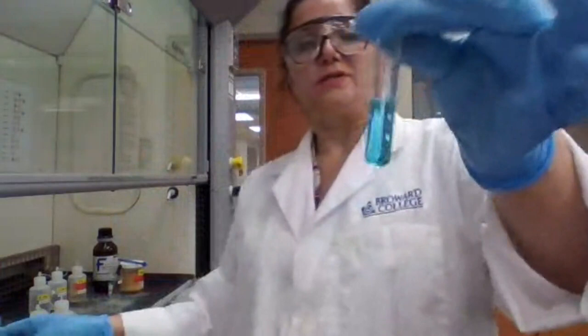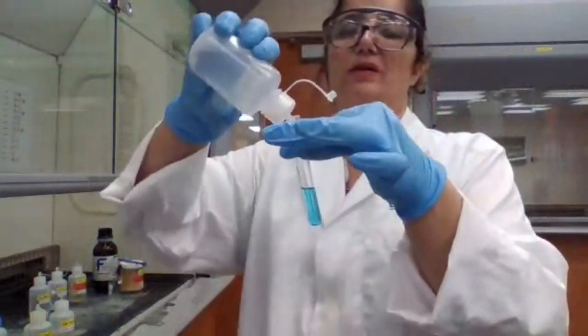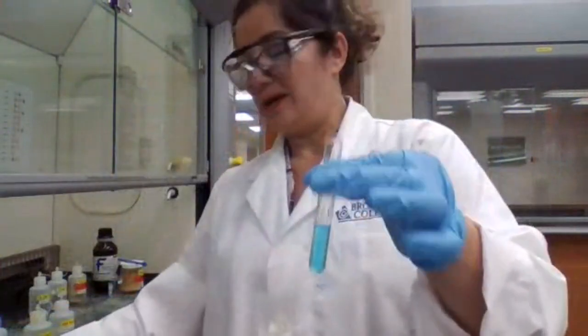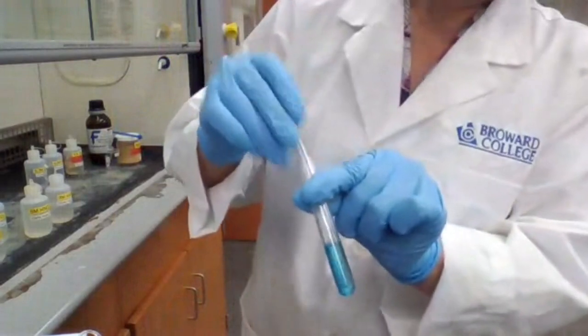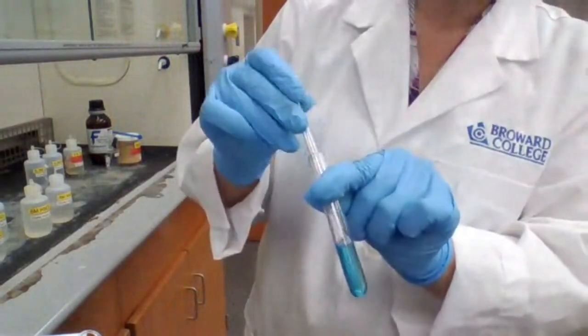The color changes as I was adding acid. I could see that the color is changing. So if the color change is complete, that's the good time for me to test it. I don't want to test too often, because if I add one drop and test it, of course it's not acidic. Nothing happened to show me, no change, no evidence.